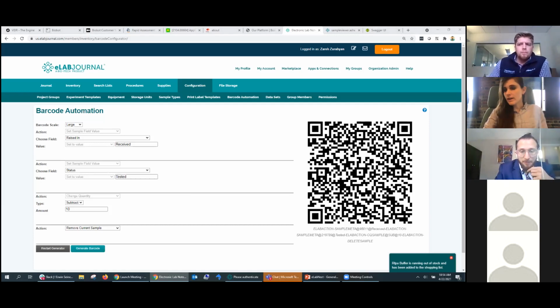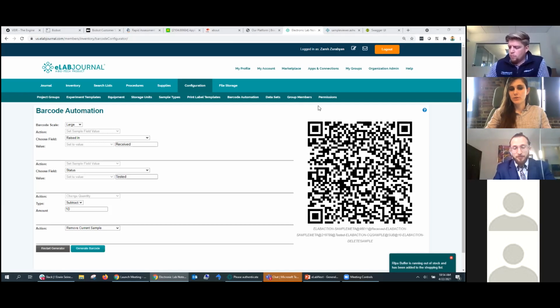They're essentially sort of like a life science marketplace. It's what we use for laboratory purchasing here. So per our biosafety permit, all biological material has to be approved by the biosafety officer. So how we handle that is scientists will put their orders in, I approve it, and then Zagino places the order on our behalf.